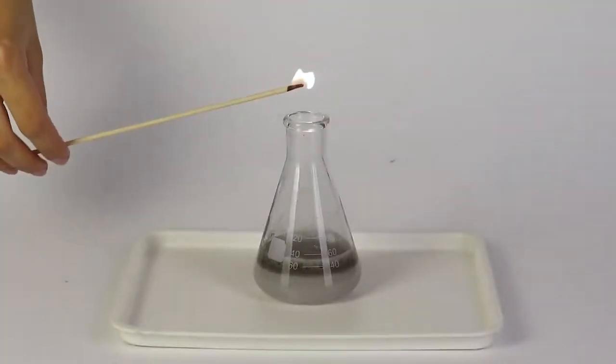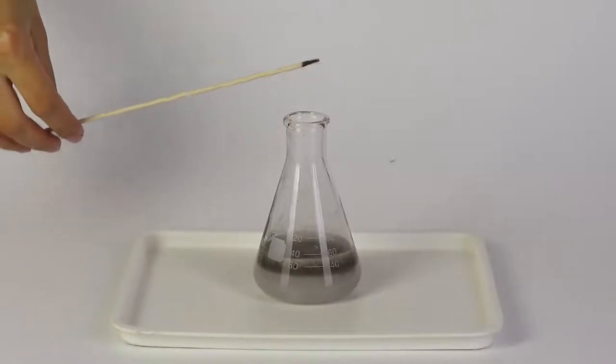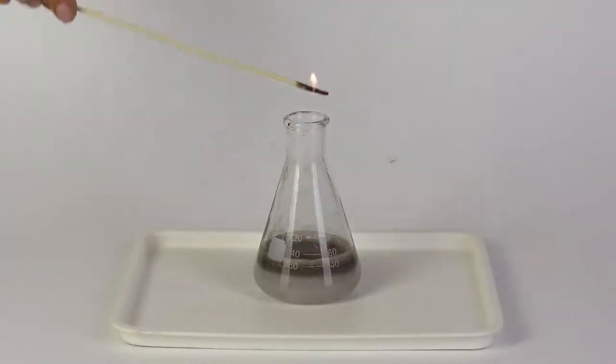Now insert the smoldering splint into the flask. Be careful not to touch the walls nor the solution.